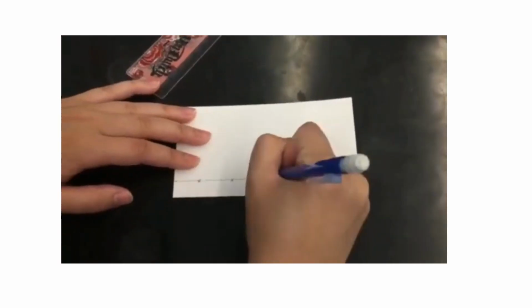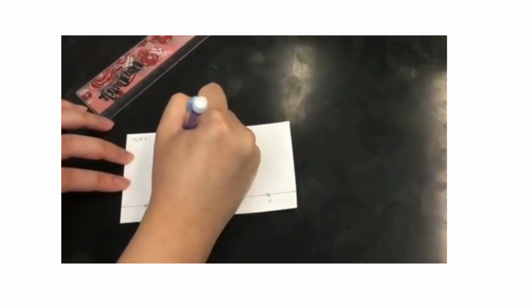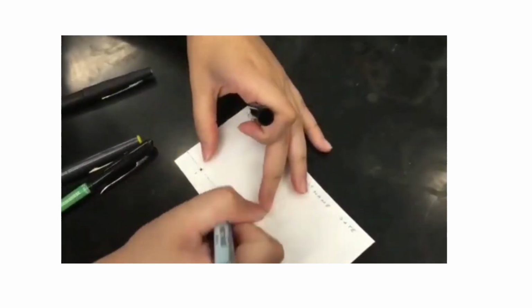Now this one in pencil we are marking, and now you see how the drugs are plotted there. The mark is kept in order to find out the distance. If the values are kept accurate, they are kept at even distance.